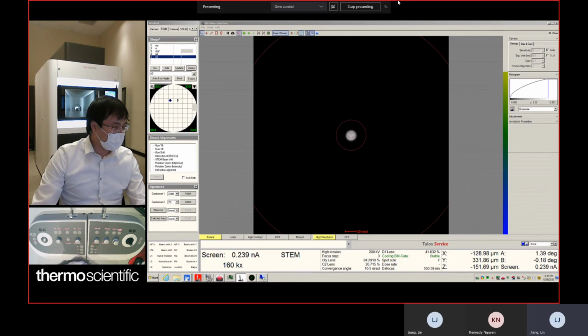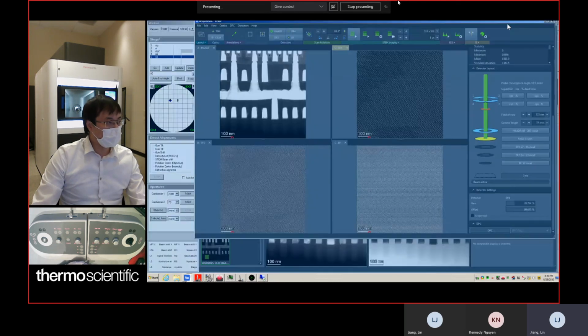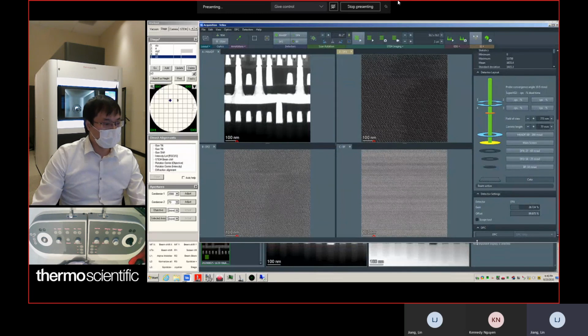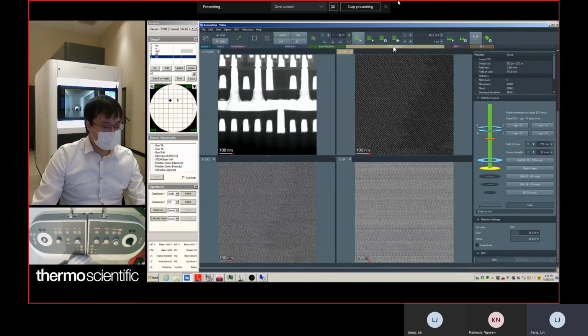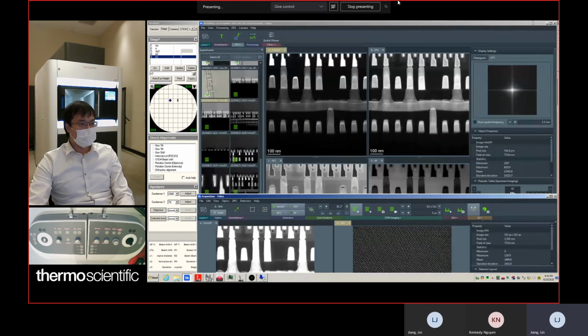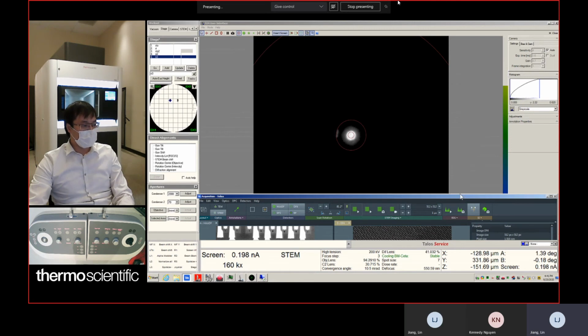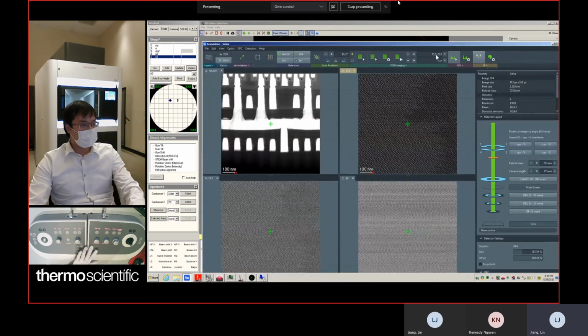Okay, and then we go there. Okay. Activation. Different screen. Okay, 77. We got the beam in the center. No, let's check that. It's not right at center. We want to make sure the beam is right at center. Yeah, it's right at center.